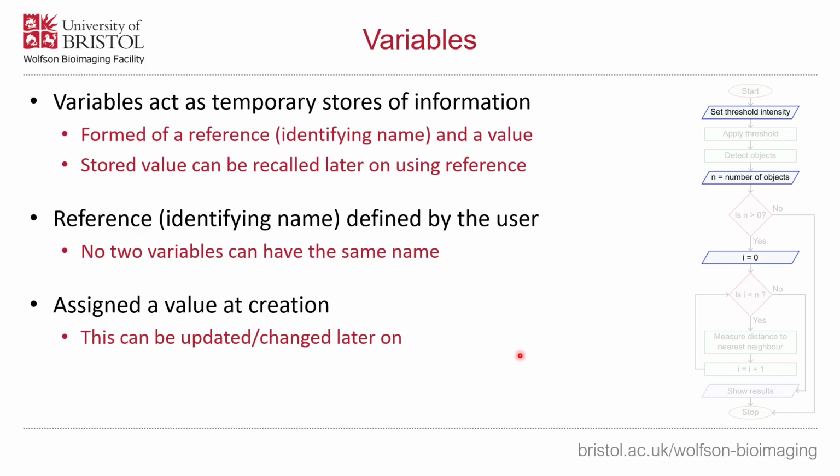It could also be useful for accessing images. So a lot of the functions within ImageJ expect explicit image names or window names, such as if you're concatenating 2 images together, it will say, take this window and take this window, combine them, create the new window. However, you want this to be as flexible as possible.